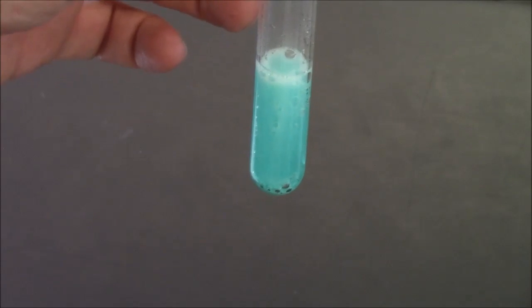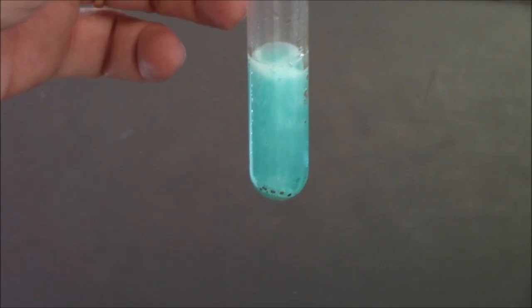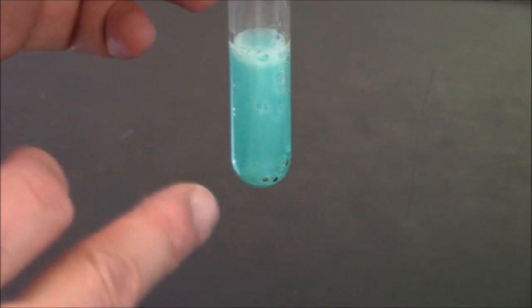It is not easy to get a green dot with this lab. It's not easy to get everything right. Most groups that fail do so because they don't pay attention to all the evidence. Some will jump on this and say, "Oh, I see bubbles. I'll ignore the color." Others will focus on the color alone and say, "Bubbles? What bubbles?" So you must pay attention to all the evidence to be successful.